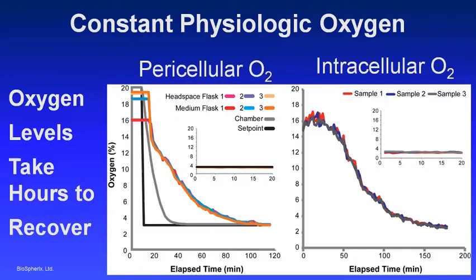And what we found here was that when the cells went back into the incubator, oxygen actually went up for a little while before it started falling. And again, of course, if the cells are never out of optimal conditions, they never experience this swing in conditions. And it takes them almost 3 hours to come back to the proper oxygen levels.